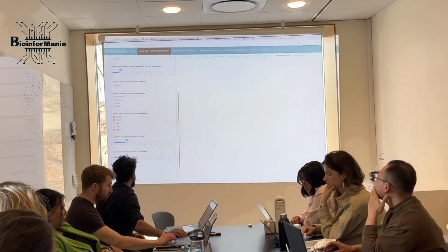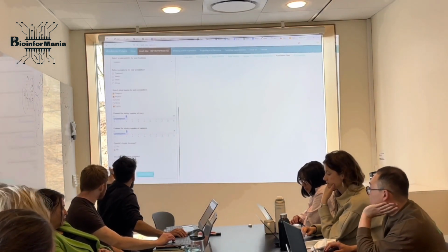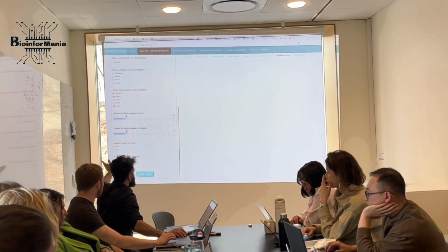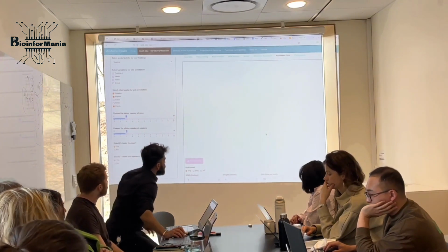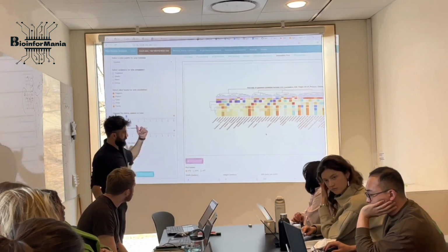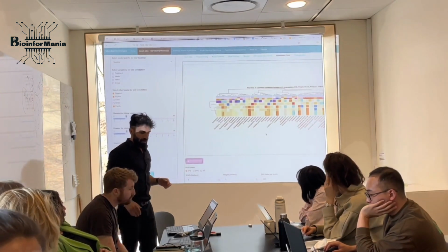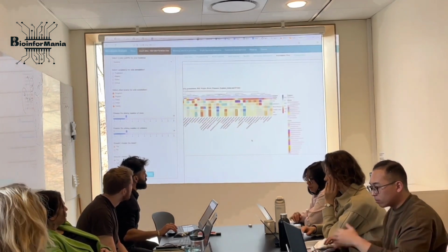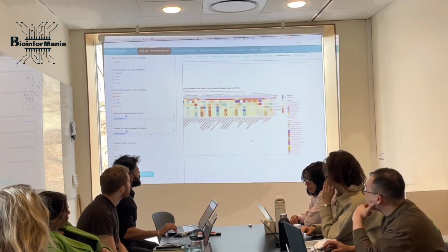And then this is for taxa. Okay, and then I say, should I cluster rows? Yes. Should I cluster columns? Yes. And now, bam! You should have a beautiful heat map of your association, like that. And then I'll tell you how to read it. If you also have a chance to overflow it on the x-axis.